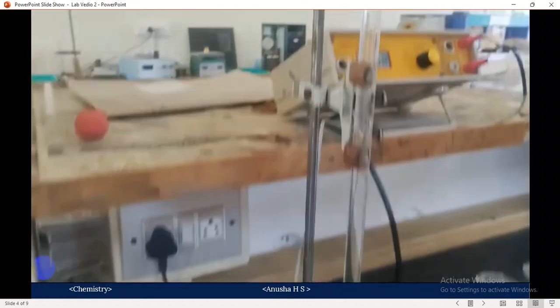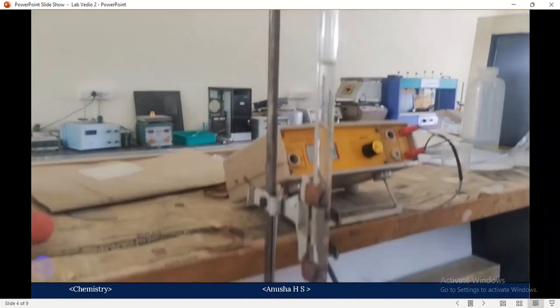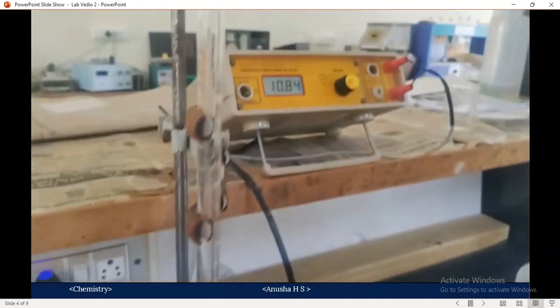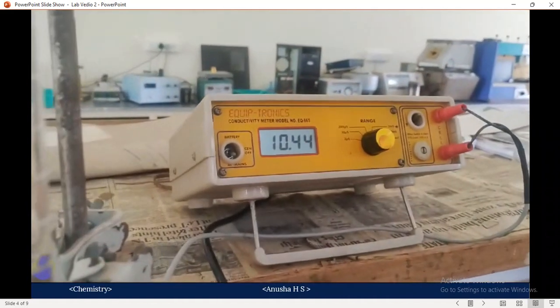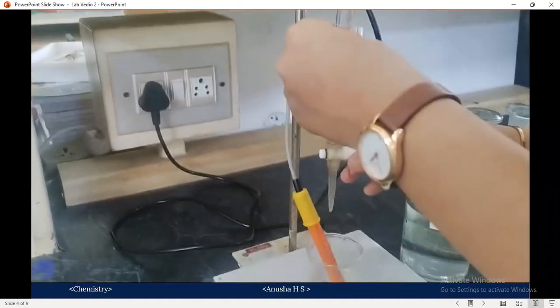After complete neutralization, the first equivalence point corresponds to the neutralization of the HCl. The second break is the equivalence point of the acetic acid solution. After complete neutralization of the acid mixture, the conductance gradually increases.